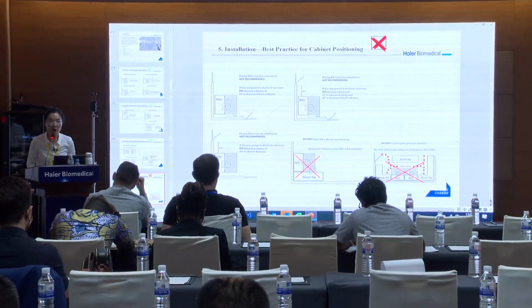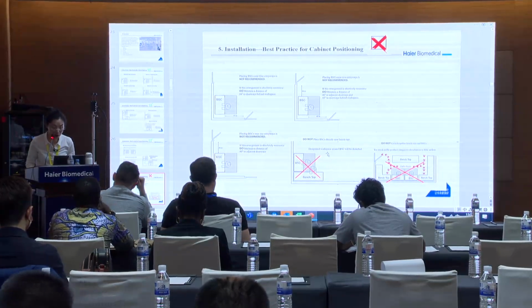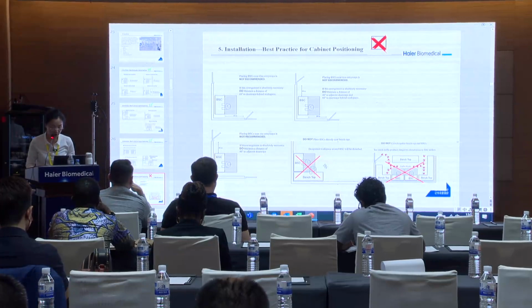And these two situations are wrong. Do not place the biosafety cabinet directly near a bench top, and do not crowd together the bench top and the biosafety cabinet.